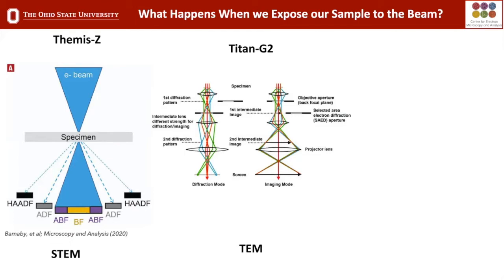What's really nice about STEM, and why typically most of what you see today is STEM, is that with the improvement in scan engines and the improvement in optics, we can form a probe that is sub-angstrom and scan that over our sample and collect multiple signals simultaneously. And that signal is considered to be directly interpretable. And what I mean by that is that where we see a bright spot, we expect an atom to be, or an atomic column to be.